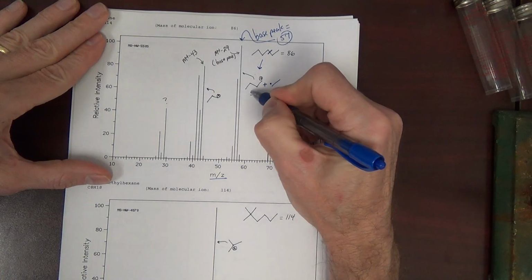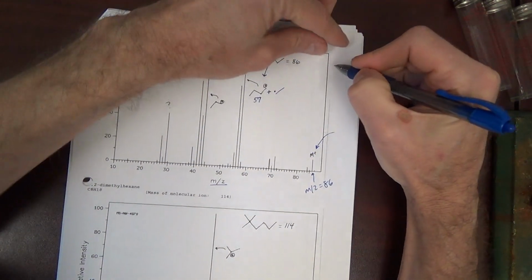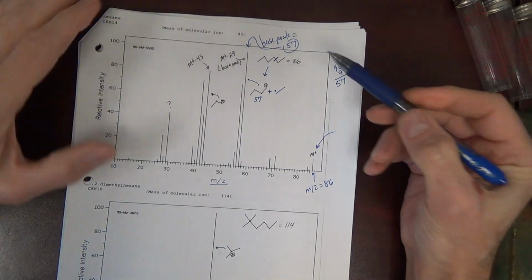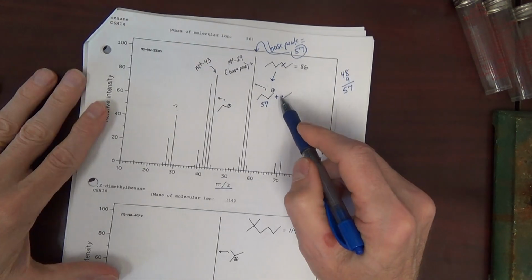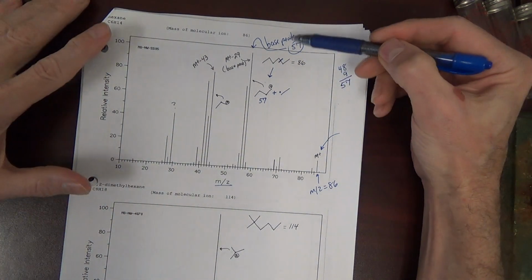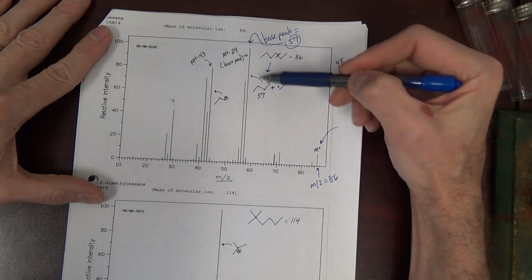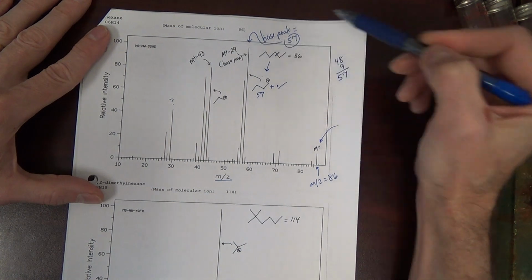Now this guy is 57. You can just add that up: 4 carbons would be 48, and then there's 3 H's here, 5, 7, 9. 9 H's equals 57. So if you add this cation up, it's 57. This other guy, we're really not concerned about, because it's not going to give a peak in the mass spec anyway, because it's not charged. So the base peak came from cleavage here. The fact that this is the base peak tells us that this is the most likely cleavage spot. The majority of your molecular ions cleaved here, and thus you produce the largest amount of these cations, and thus the largest amount of current at 57 to give a peak at 57.